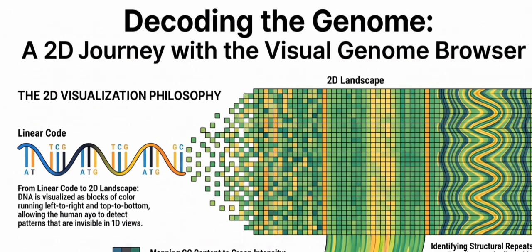And that's where the filter comes in. By typing protein plus into the filter, you instruct the software to evaluate every single annotation. It checks for that open reading frame we discussed earlier, and if the gene does not possess the capacity to code for a physical protein, it is removed from the screen. So it just strips it all away. Yes. You filter out the pseudogenes, the RNA genes, the regulatory elements, leaving only the protein coding architecture.